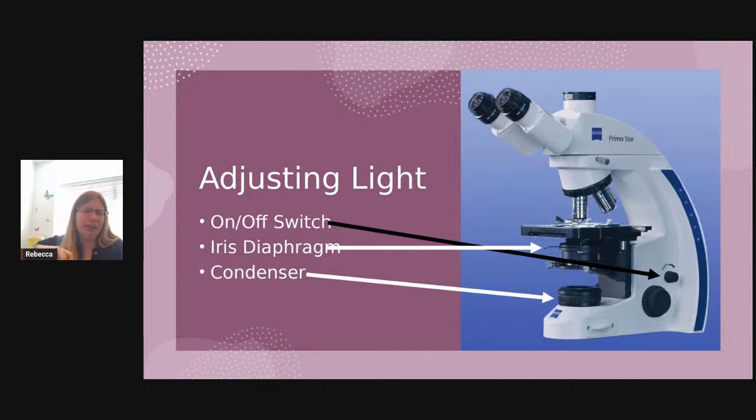It's kind of like opening a jar, but it just has a part on the side that will move and it will create a shutter open and close to have more of that light from the light bulb actually coming up through the microscope that you're seeing. So I would say on-off switch, condenser is really what you should change second, and then the iris diaphragm would be what you change last to make those most minor adjustments.